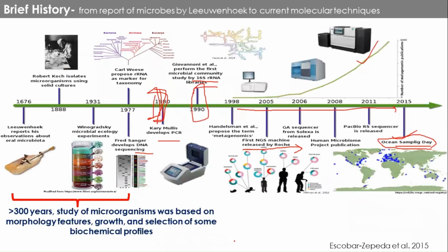Now, coming to the molecular method, in the last 20-30 years we have seen a considerable increase in the utilization of molecular techniques to identify or to enumerate microbial cells, and that includes PCR techniques, that is polymerase chain reaction, and first generation sequencing, that is Applied Biosystems or the Frederick Sanger method, automated DNA sequencing, and then developed to second and third generation, that is Illumina, 454, and then PacBio and Oxford Nanopore sequencing, right?